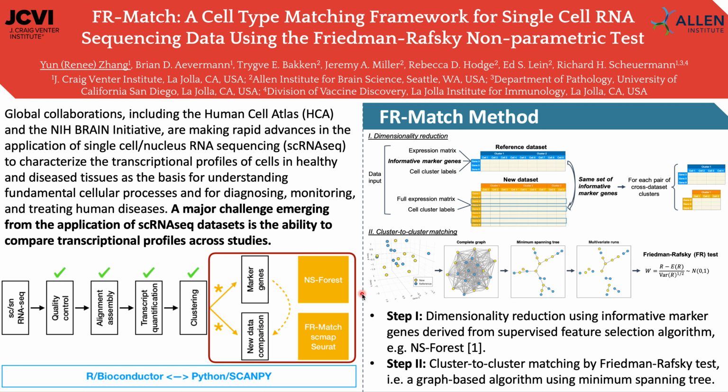My poster here is to present a new computational software called FRMatch, a cell type matching framework for single-cell RNA sequencing data using the Friedman-Rafsky nonparametric test.